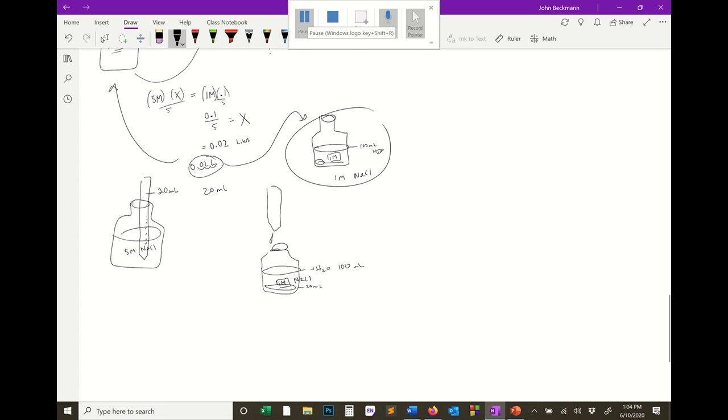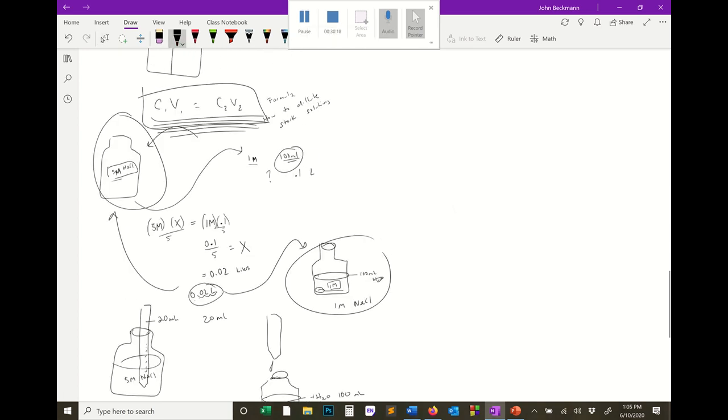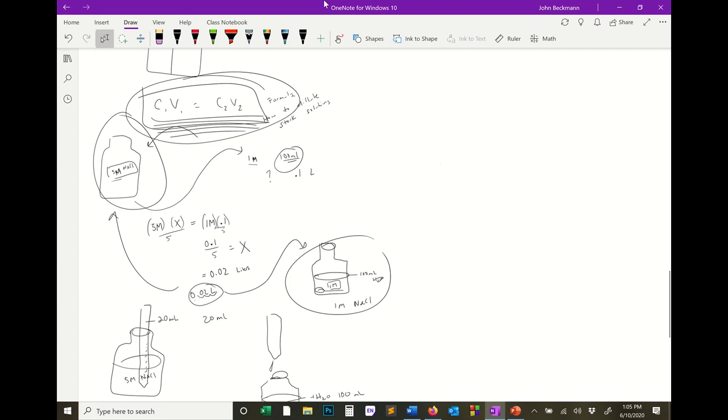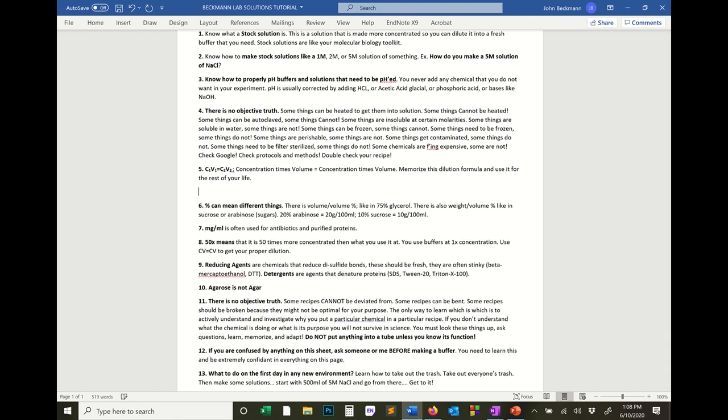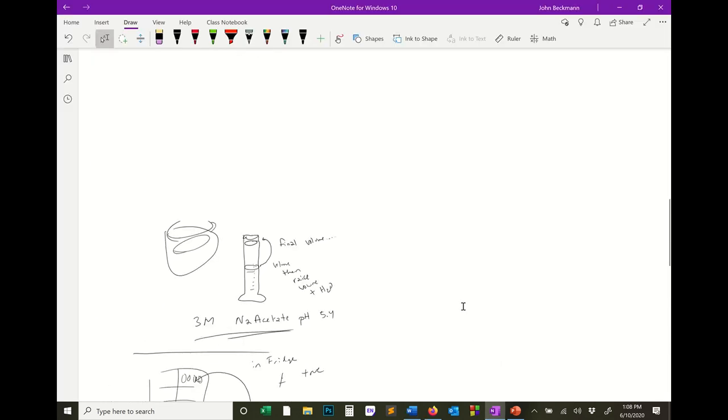Okay? So that is how we use our stock solutions to make working solutions using the formula concentration times volume is equal to concentration times volume. Okay. Now, the next rules are kind of interesting things that I've learned throughout my experience and time working in the lab. And I want to point them out to you so that you learn even faster than I did. Okay? So number 6, when you hear percent in the lab, percent can mean different things. So let's talk about that.